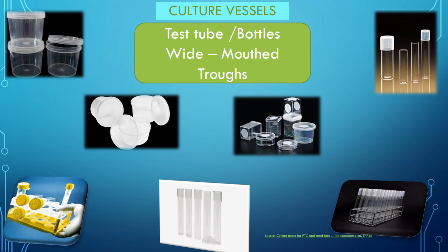Normally, the growth medium is prepared and aliquoted into the culture vessels in the required volume. Then the containers are closed with the lids and properly autoclaved. During autoclaving, the lids are fixed on loosely and they are tightened after the autoclave cools down.